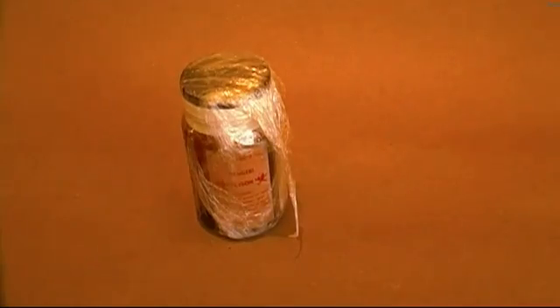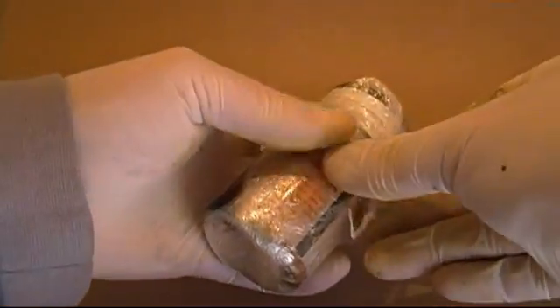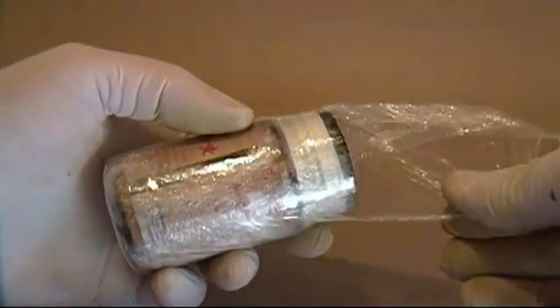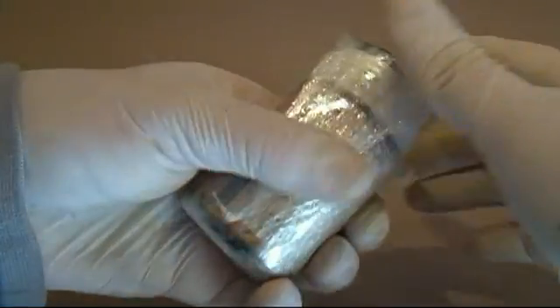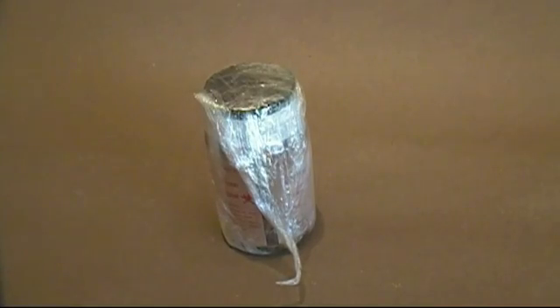This is the poisonous compound mercury sulfate. Since it's in a glass bottle, I like to add some extra insurance in case the bottle is ever broken. This shipping shrink wrap works great for this. Since it's clear, I can see through it to the info on the bottle. If it was ever dropped, it would contain the glass and the compound, saving me from what otherwise could be a dangerous mess.